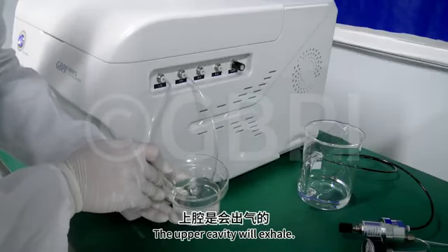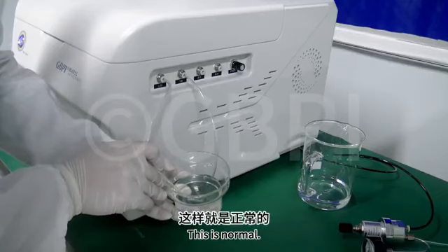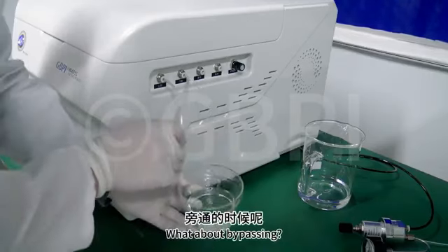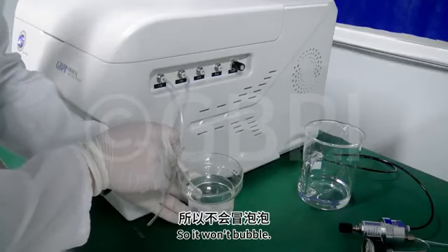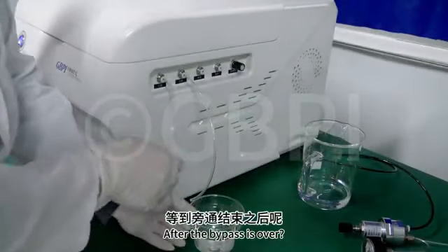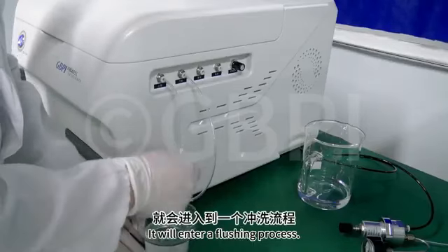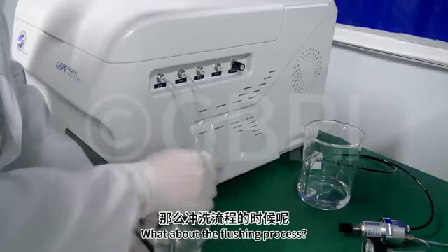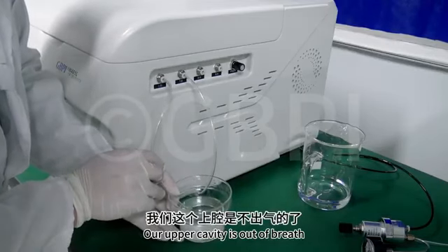What about when we bypassed? The upper cavity will exhale. Bubbling was observed. This is normal. What about bypassing? The lower chamber is airless, so it won't bubble. After the bypass is over, it will enter a flushing process. What about the flushing process? Our upper cavity is out of breath.